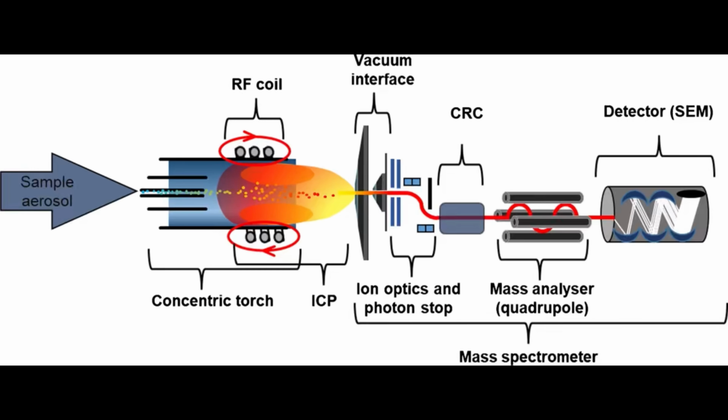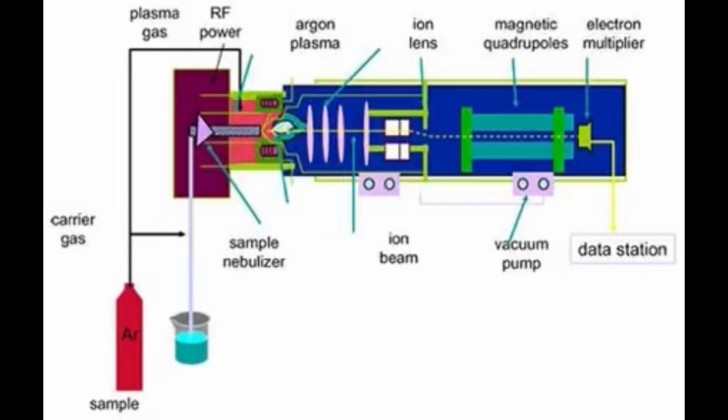Now, coming to ICP-MS, that is inductively coupled plasma mass spectrometry, it represents a completely different application space. This technique is frequently applied for elemental analysis. In ICP-MS, your sample is introduced into an extremely hot plasma around 6000 to 10,000 Kelvin, which completely atomizes and ionizes everything.